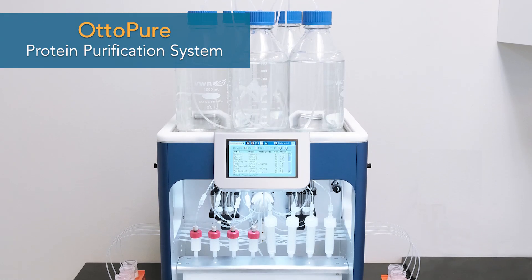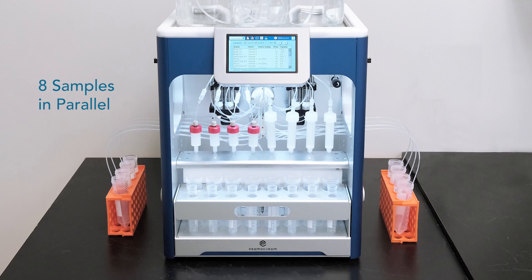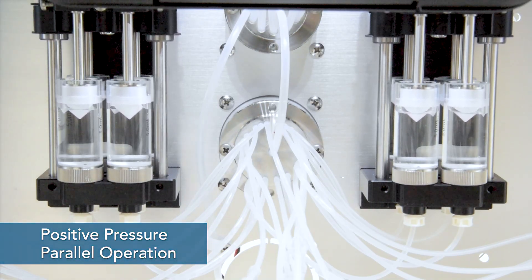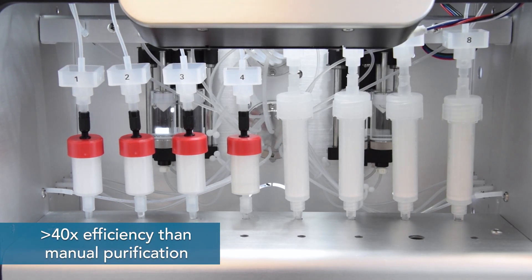OttoPure, high-throughput protein purification system can process up to 8 samples in parallel. By utilizing positive pressure and parallel operation, more than 40 times efficiency has been achieved compared to manual purification.